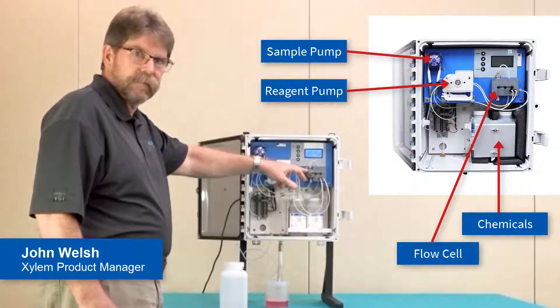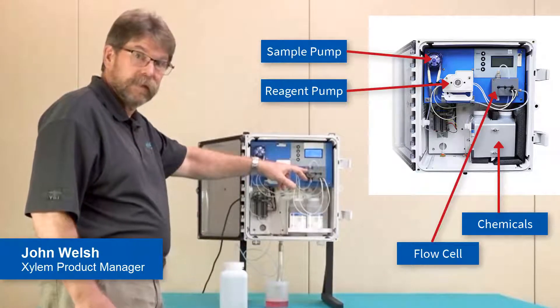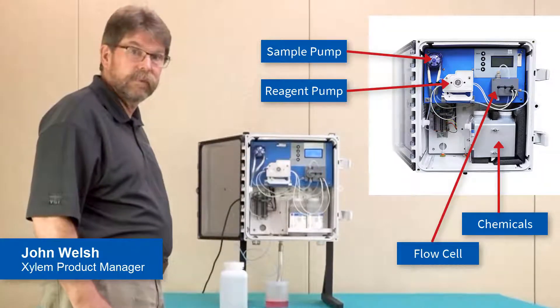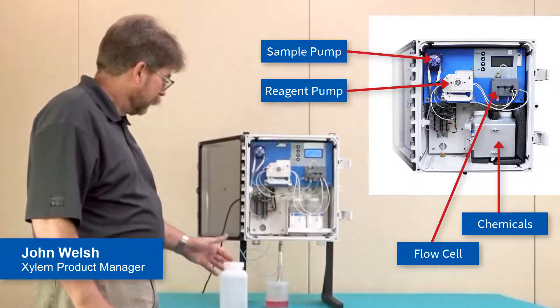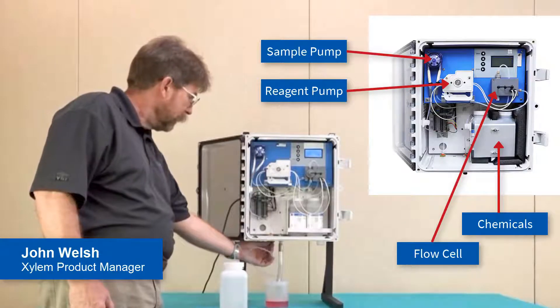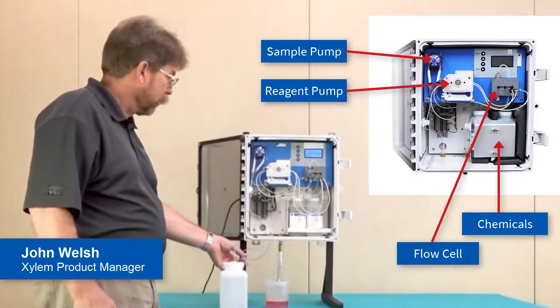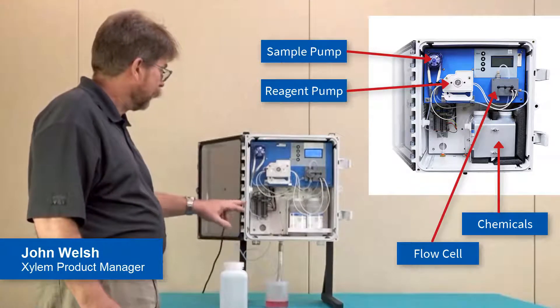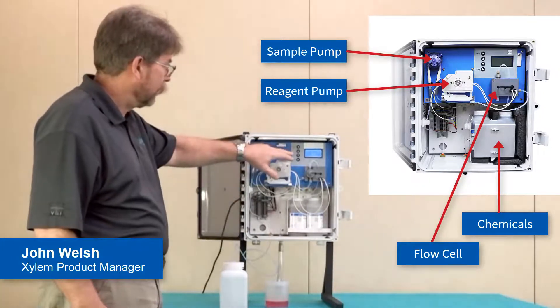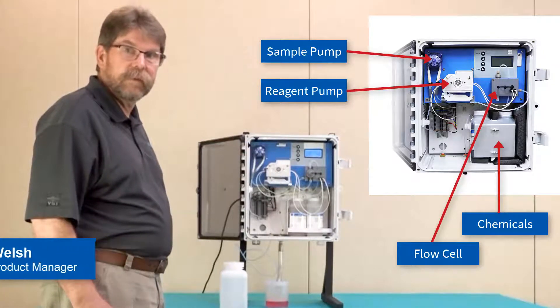One of the features of the model 3017, at least from the startup perspective, is that we do not necessarily need a process sample in order to run the instrument. As you can see here, I've connected a sample of tap water through the sample inlet line directly at the bottom of the instrument. From this point, now that I have primed all of the reagents and the sample, it would be a simple matter from the touch screen to select Start Up and the measurement cycle would begin.